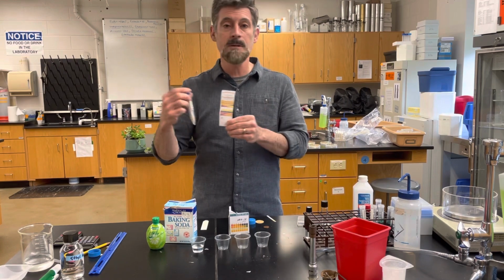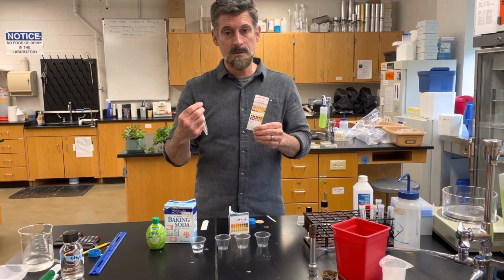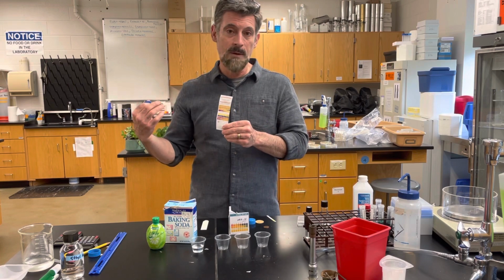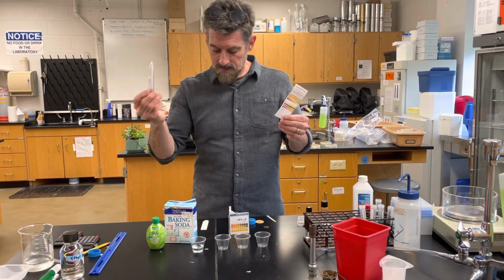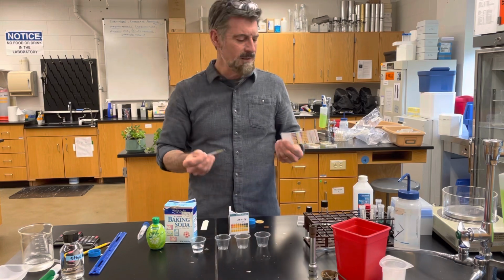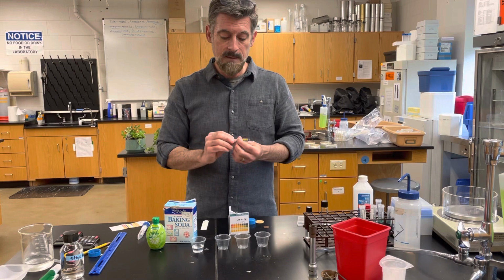We've used these compared to a digital pH meter and found very, very similar results most of the time. Often the pH meter has errors if it's not calibrated properly, whereas the test strips, as long as they're new, work more reliably for us in the lab. So this is actually a fairly good thing to do. Now the samples I'm going to show you look a little bit different than the ones that you have, because this is what I was able to find here for me today.